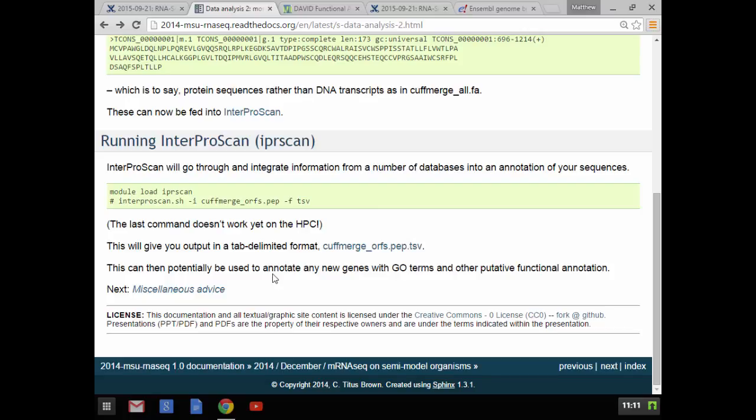So again, once you have that, you can't do it all on the computer. All of this stuff, be it generating the CSV file that you are actually going to use because it has differential gene expression, be it taking any useful gene IDs and taking them to DAVID or PantherDB or any other tool that gives gene annotation, gene pathway kind of stuff, is all stuff that you're doing by hand, and there's going to be a certain amount of custom work involved in any of it. So in this case, even if you run InterProScan, it works great.